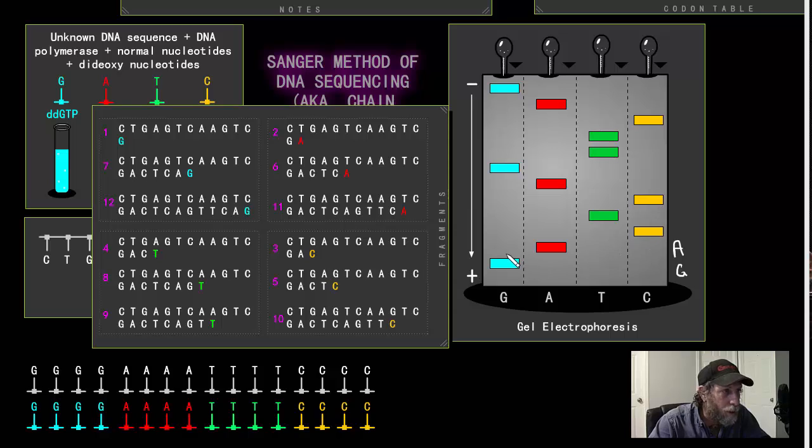We're basically going like a game, jumping: okay, I've got to jump to the next level there, and then jump to that level, and then to that level. It's kind of a weird game, but that's the idea. So the next band of DNA is in the C lane, so that base is C. And the next one is in the T lane, so it's T, and then it's C, and then we just keep reading upwards. A, and then we're back over to the G, and then we have these two, a T and a T, and this is getting out of line, a C, an A, and a G.